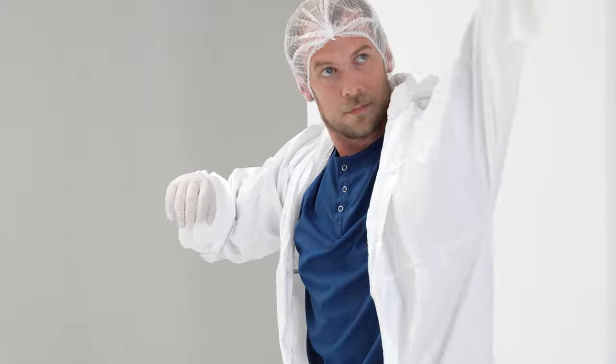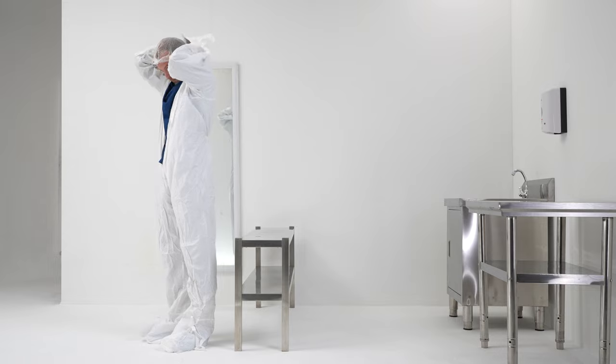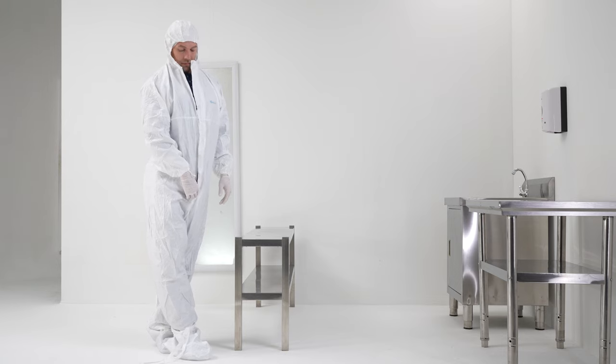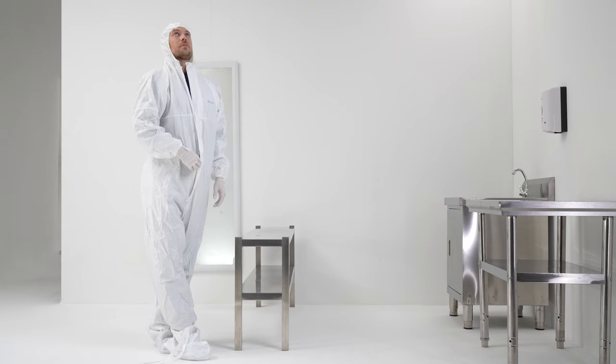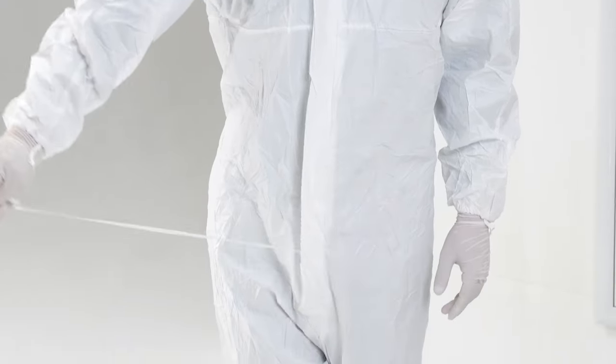Bring the coverall up towards the shoulders, then insert the arms into the sleeves. Pull the hood over the head, making sure it covers over the hairline. Cross your legs and zip up the coverall fully. Remove the backing liner and stick the flap over the zipper.